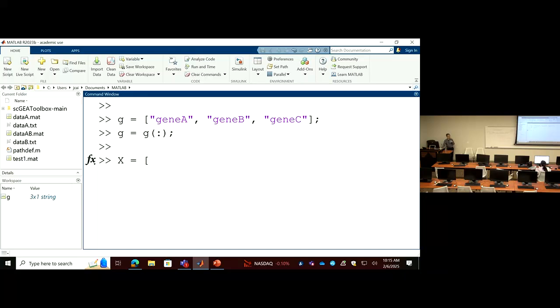So we have some principles. Number 1 is that this has to be non-negative. You don't put -1 because these are counts, right? Another rule is that each row represents one of the 3 genes. If you randomly select 3 genes, you don't expect them to have the same expression level on average.